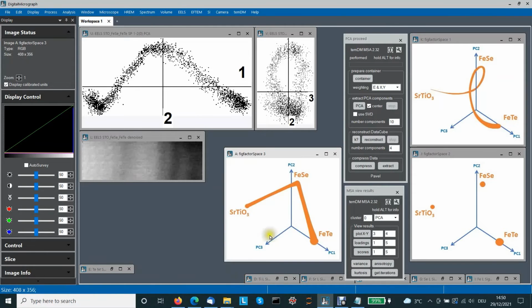It's not something like a straightforward variation between the given points in vector space. No, it's much more complicated. It's a trend, but with quite an interesting form. Yeah, I suppose that is quite an important finding.